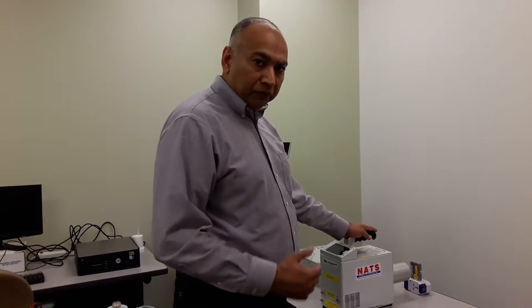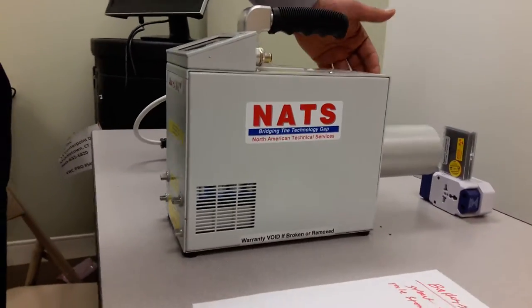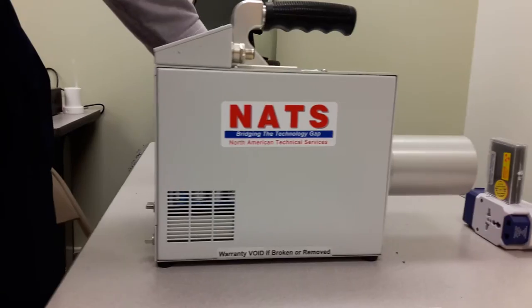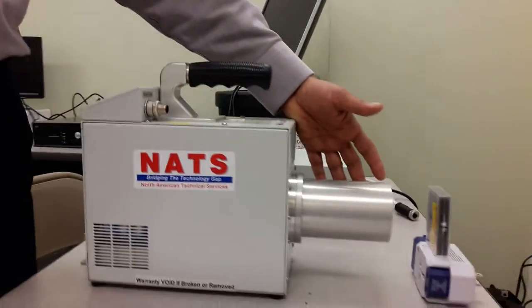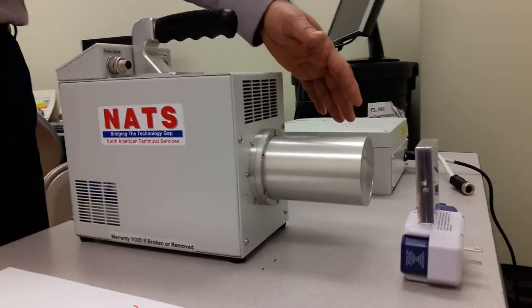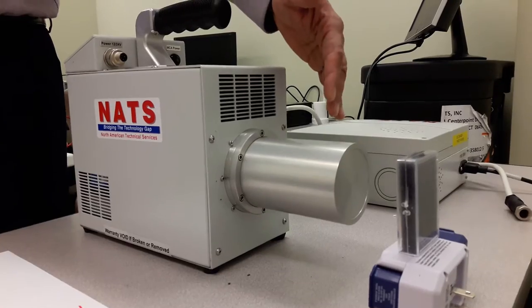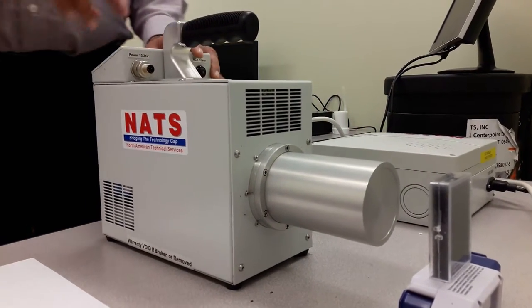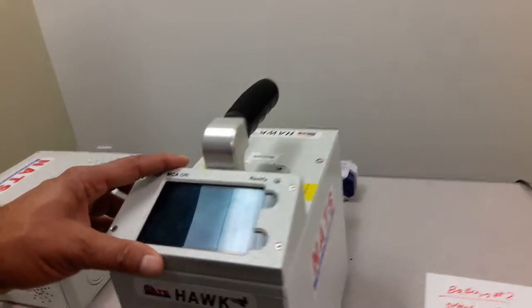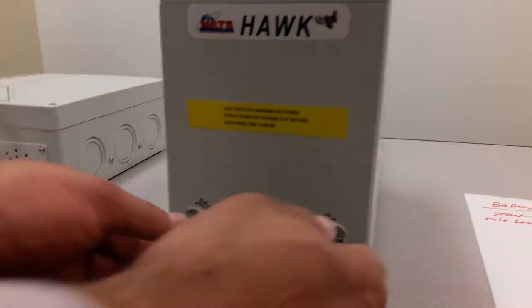This is the Hawk system. It comes with a 10% coaxial germanium detector. It has a cryo cooler inside which is a 50-watt rated cooler. A 10% germanium coaxial detector means that it has a full-size crystal in it — it's not a planar germanium which only allows you a slice of a crystal. It has a display in the back which is based on a Samsung Galaxy smartphone, and interchangeable batteries inside.